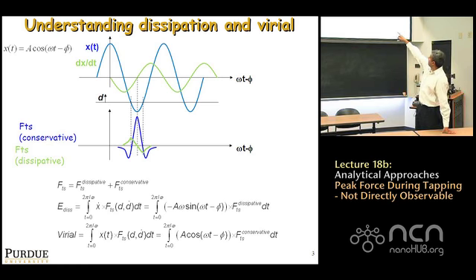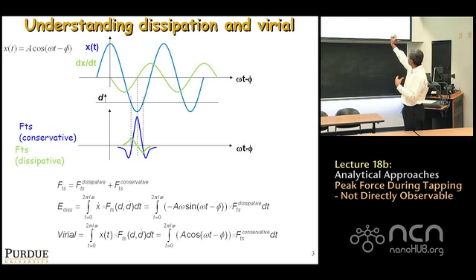So in this case, I have placed the sample at that solid horizontal line from which the D is the tip-sample gap. The origin of D equal to 0 is shown there, that's solid. So which means that when D becomes negative is when you're indenting the sample. When D is positive, you're above the sample. So roughly, interaction forces will exist in a range of time period where the tip comes close to the sample or indents with the sample and so on, okay?